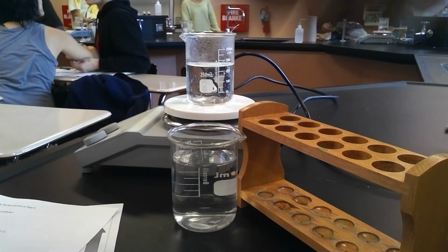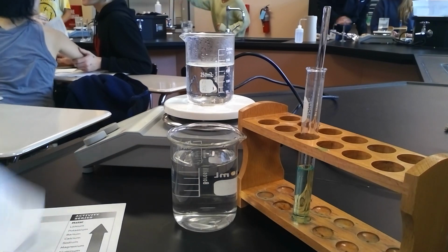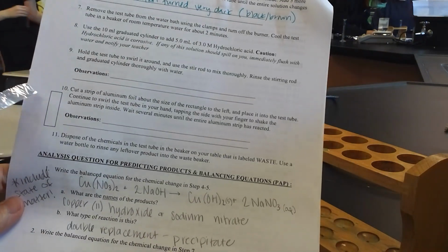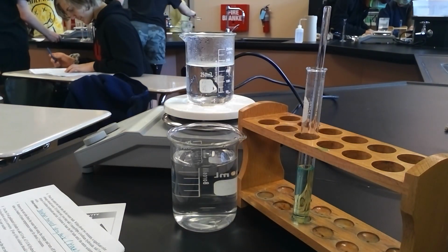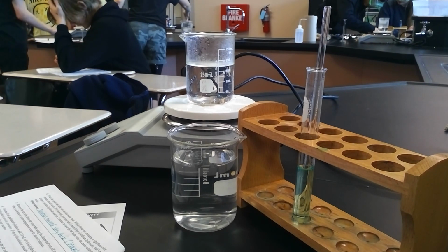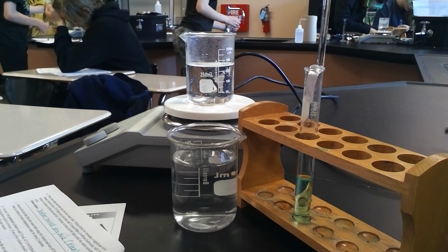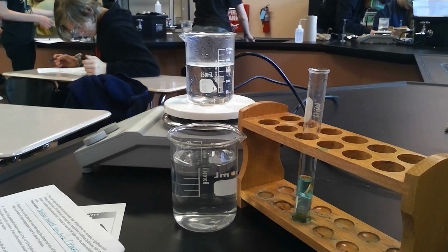I'm going to dry it off and put it in here. And then I cut already a little piece of aluminum foil, so it's about that same size. It can be slightly larger or smaller. And so I'm going to go ahead and just drop that right into the test tube. Mine's a little thick, but that's fine. I'll just kind of shove it down there. So letting that sit.